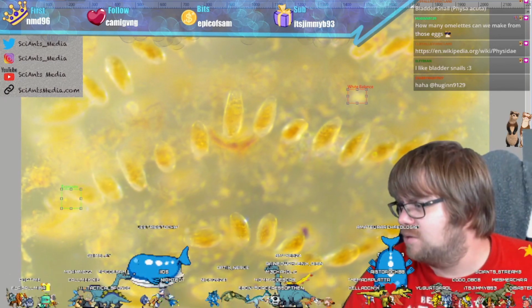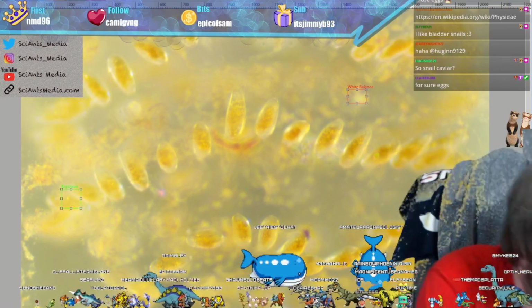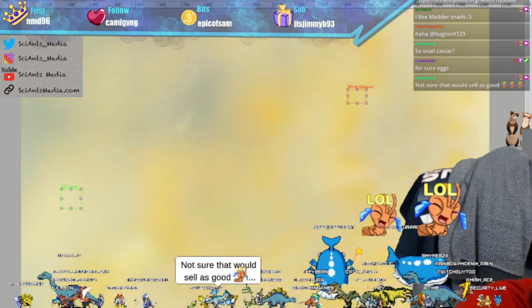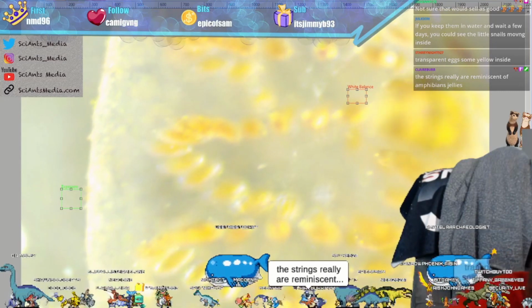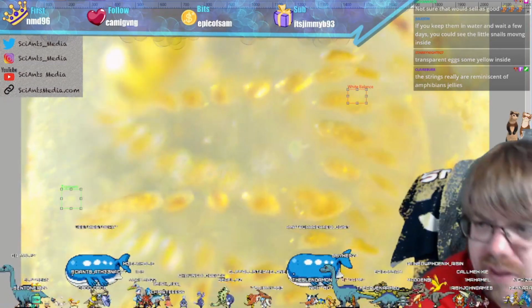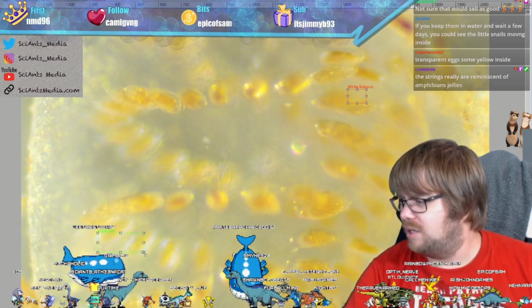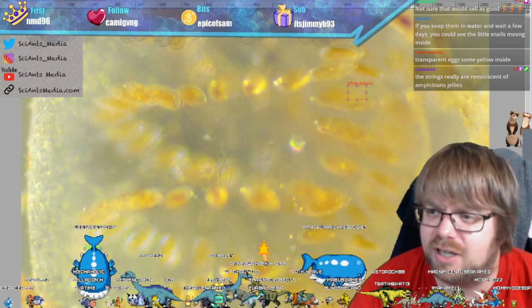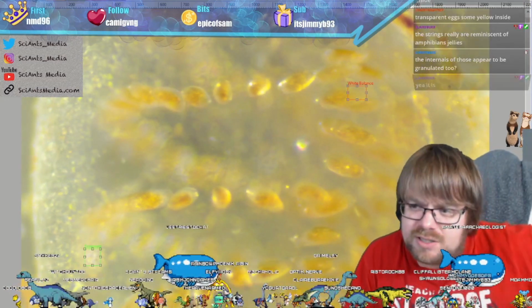That's a nice, close look at those actually being eggs of some kind. Maybe we can find one that's a little bit developing, or wiggling around or something. They all look pretty much the same stage, so not a lot of variation to go on that front yet. Still a really lovely look at it. There we go. That's actually a really nice shot. We'll post these in Discord as always too.